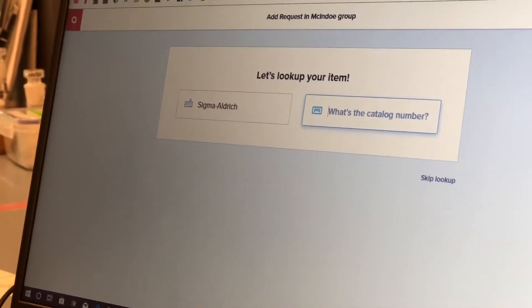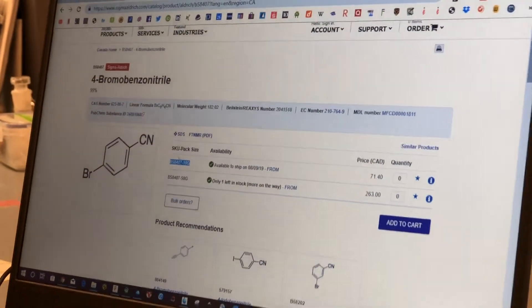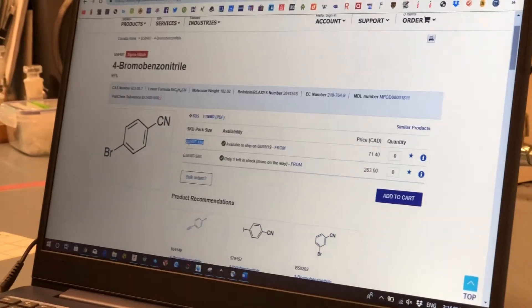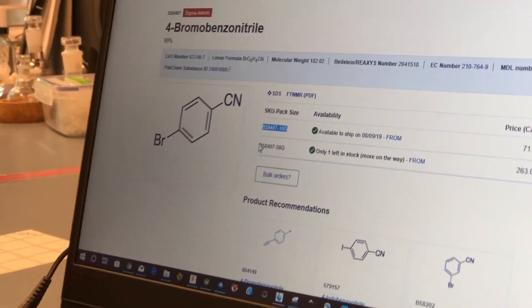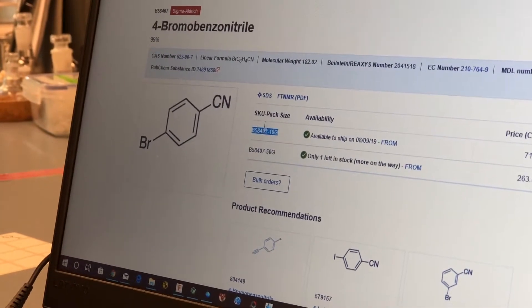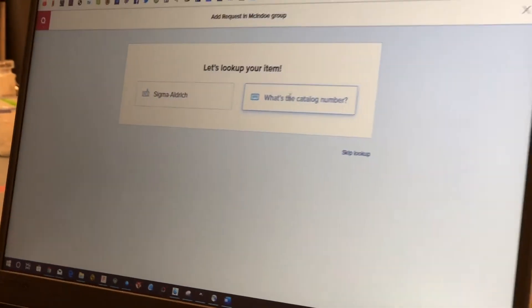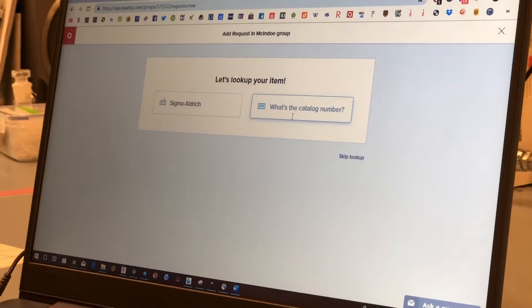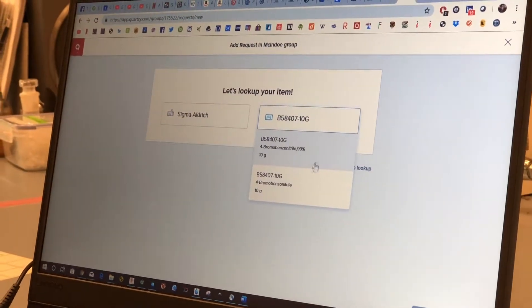You click that and then you get the catalog number. So in this case we want to order 10 grams and copy paste it in this field.